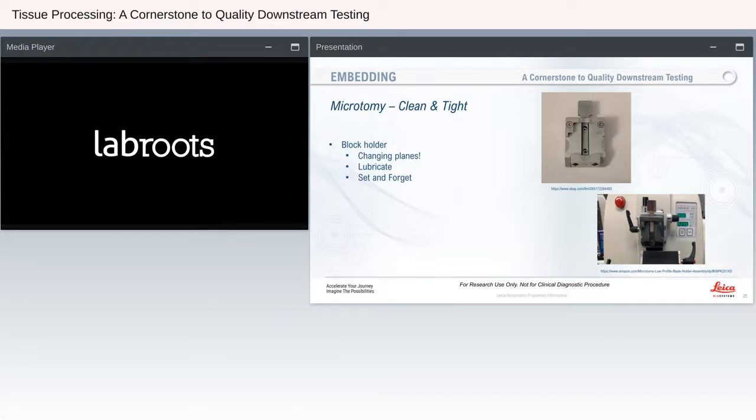There's nothing worse than sitting down trying to cut tissue that is inevitably, it's always the case, a small tissue, and having the plane change where you might have the risk of losing that tissue when you begin to section. So once it's set at zero on either plane, you just want to set it and forget it. With either chuck holder, you will see at the bottom, when you pull the lever forward to put your block in, there are two springs at the bottom.